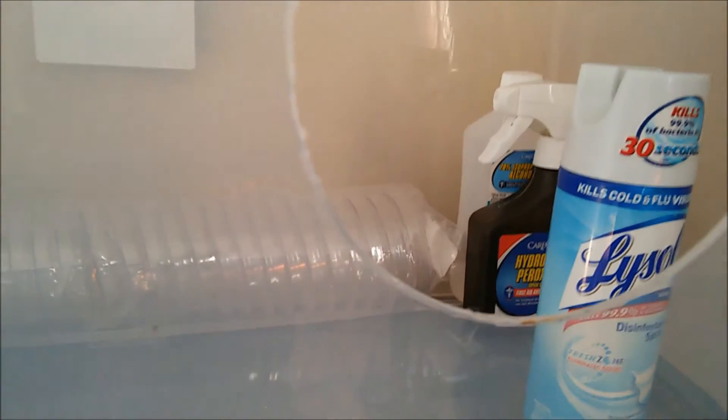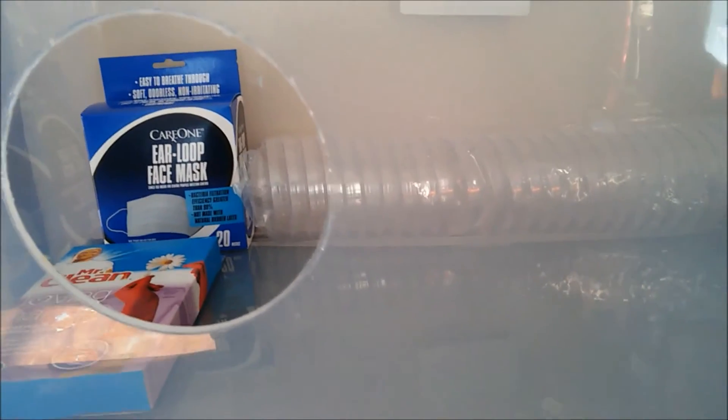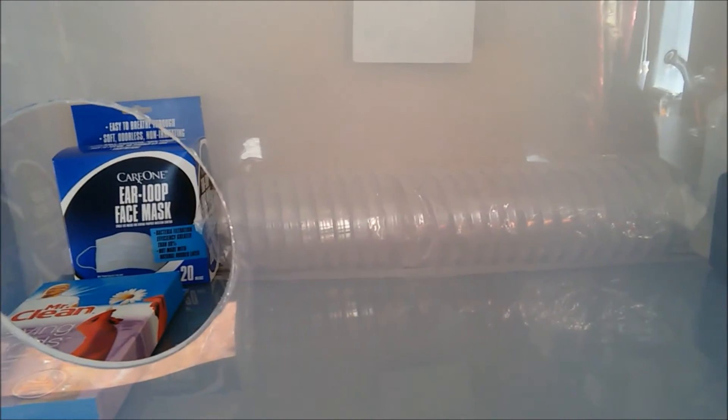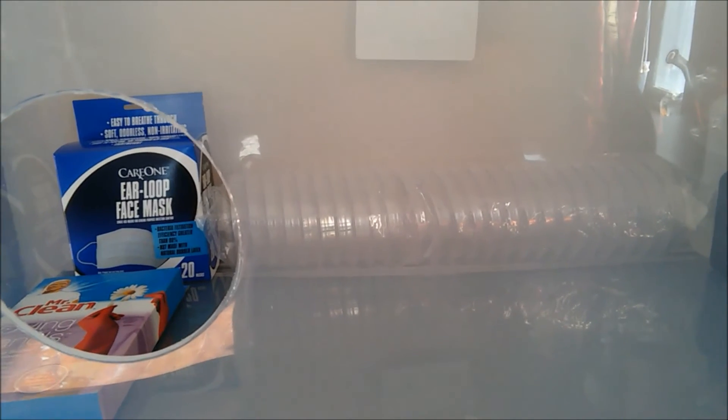You can see in the back we have hydrogen peroxide, which we will be using whenever we clone outdoor species, and then we just have some alcohol, which we use to keep everything sanitary. If you guys stay tuned, we're going to be putting up a video on how to make your own alcohol lamp, and we're going to be using that to get a little bit more sterility.